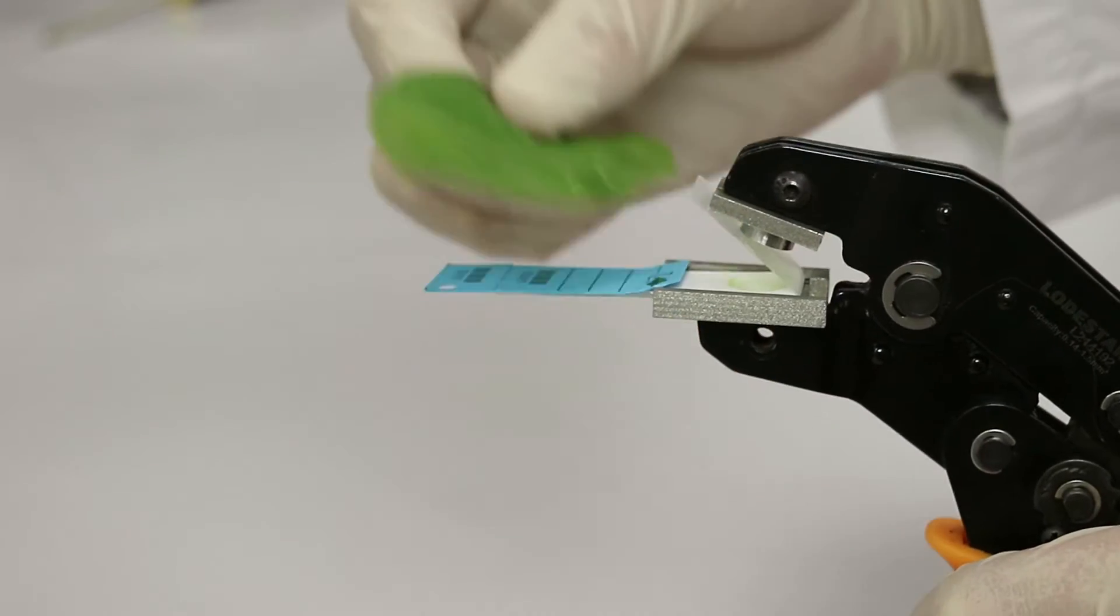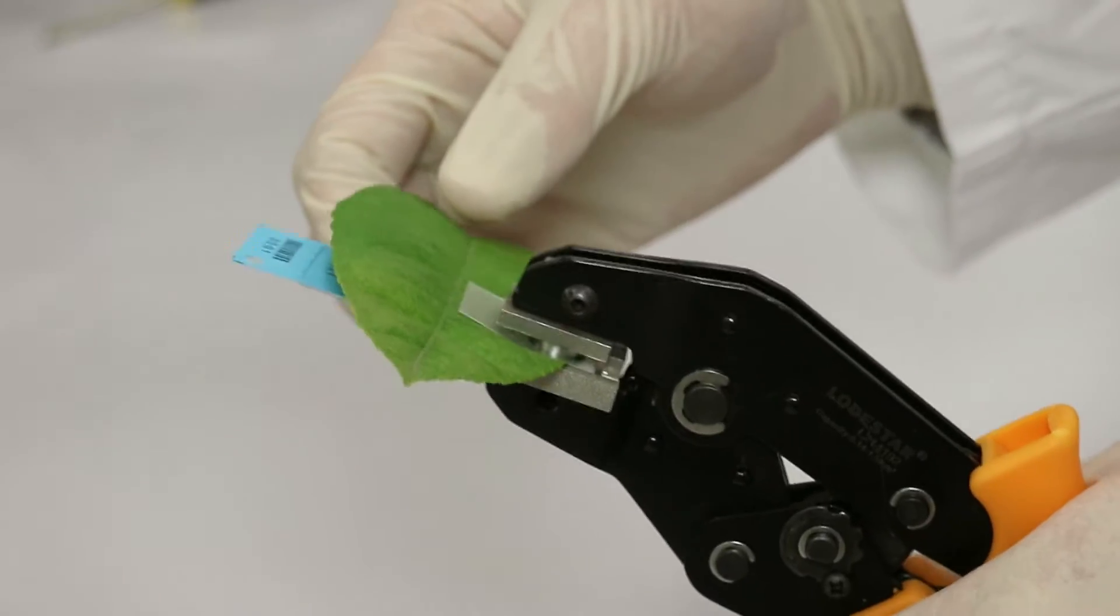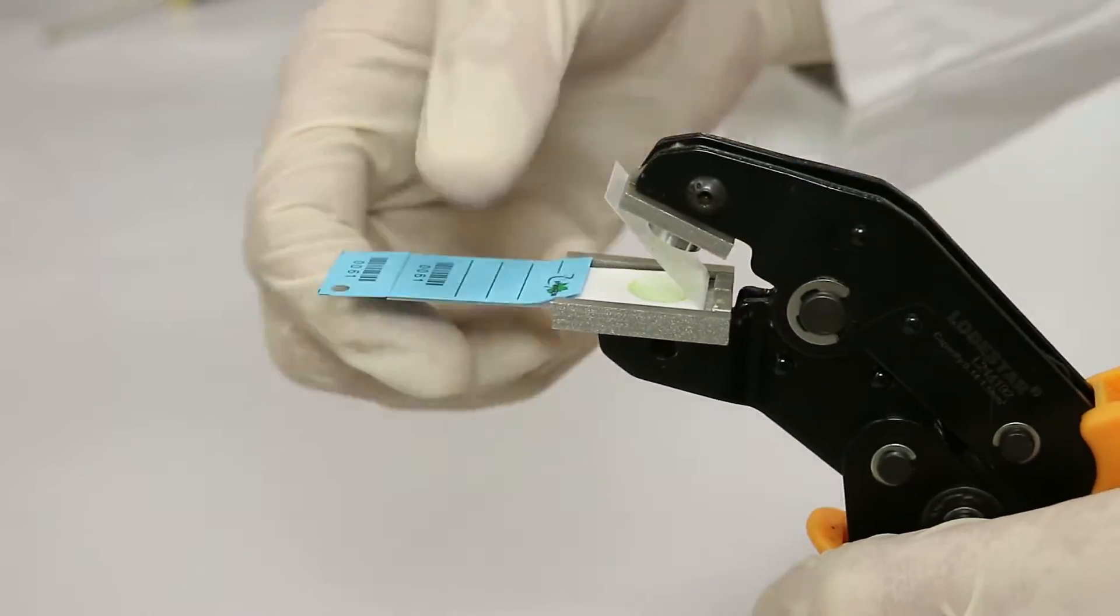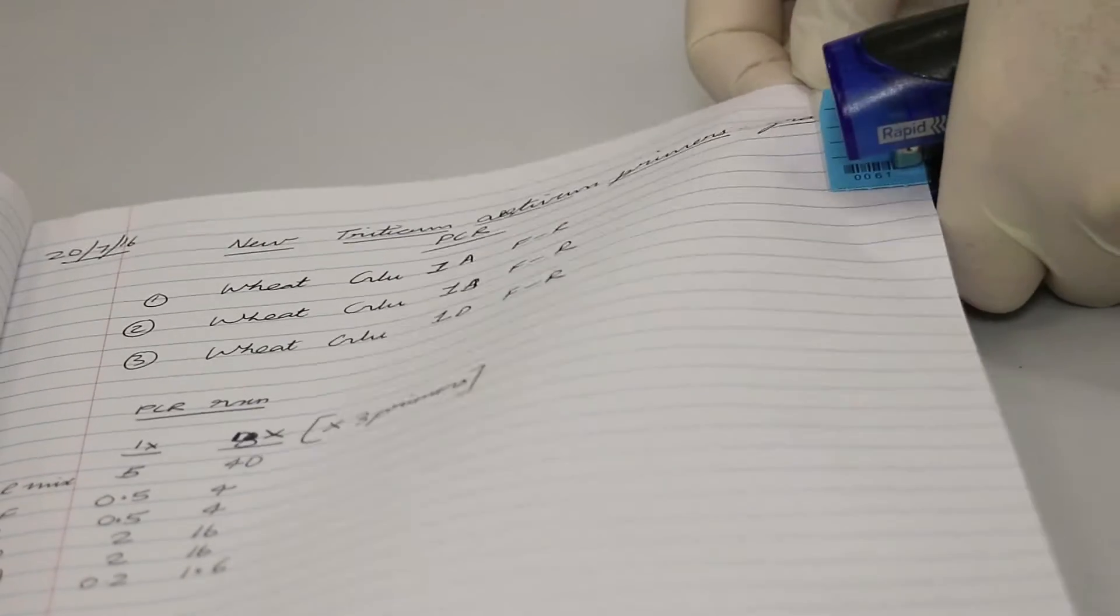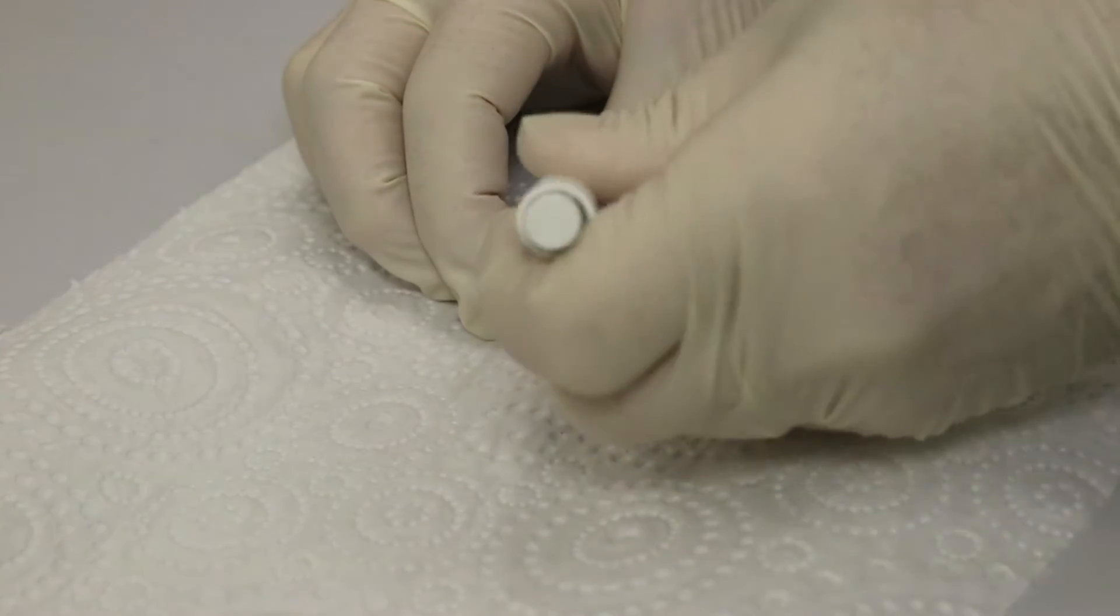A storage card is loaded into the collection tool and the plant material crushed onto the card. Sampling can be done in the laboratory, greenhouse or even at the farm. Cards can be set aside for long term storage or can be processed immediately.